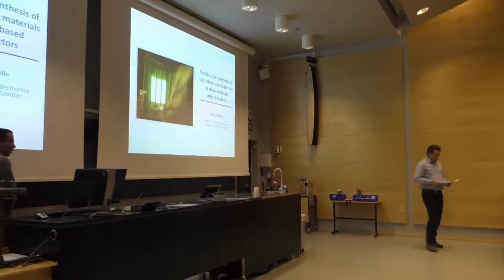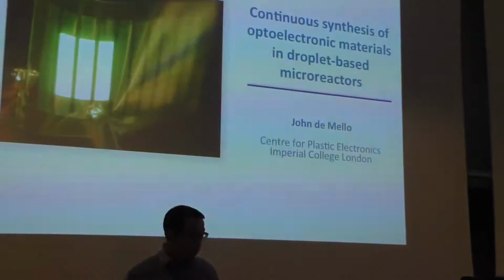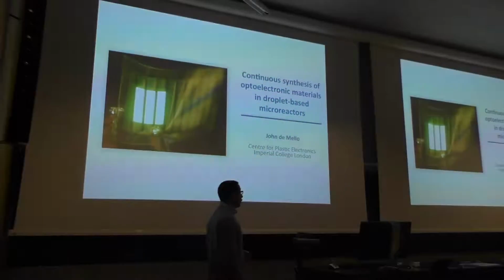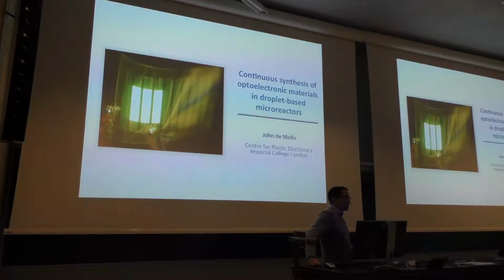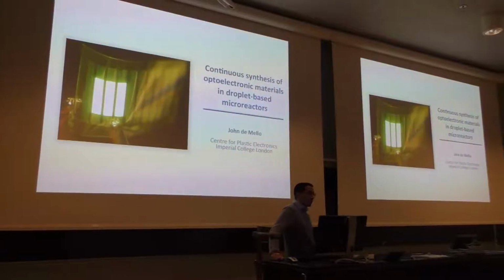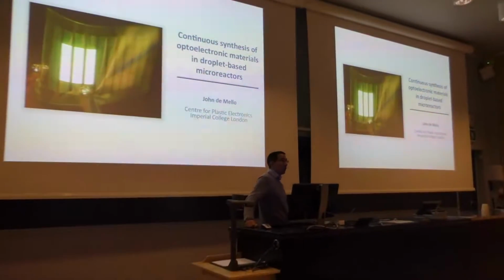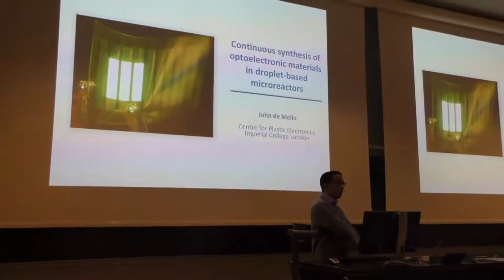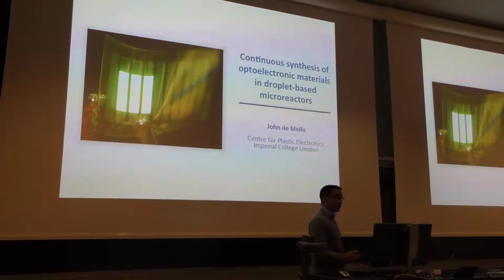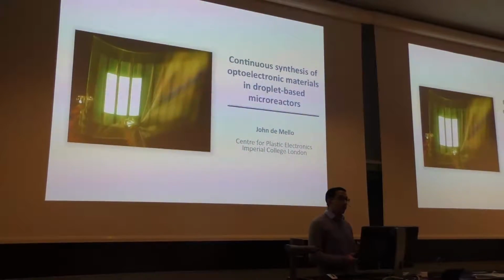Thank you, Stelios. Yes, great pleasure to have the opportunity to talk to you. What I'd like to talk about is some work that we've been doing over the last 10 years, really, trying to develop techniques for synthesizing materials with more control than you typically would have in a conventional flask-based reactor. And we've focused most of our efforts on electronic materials where we're interested in optimizing physical properties.